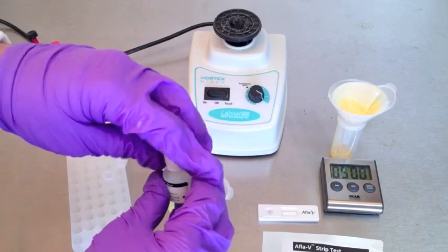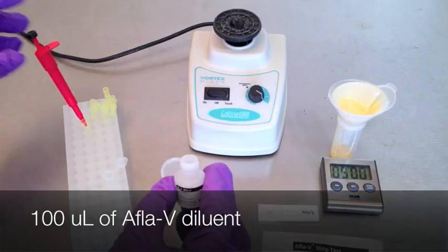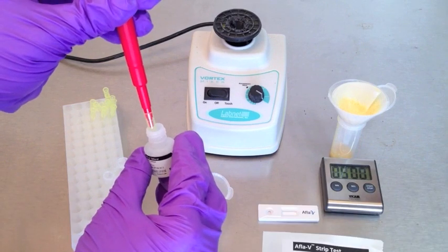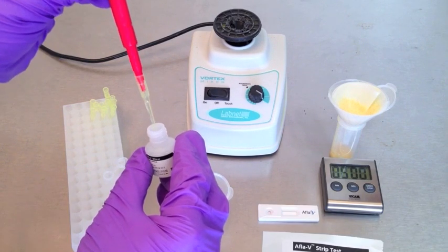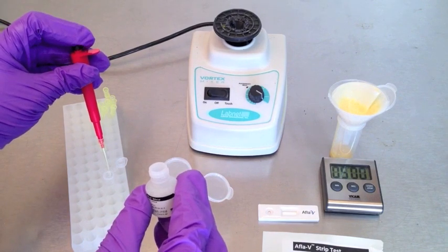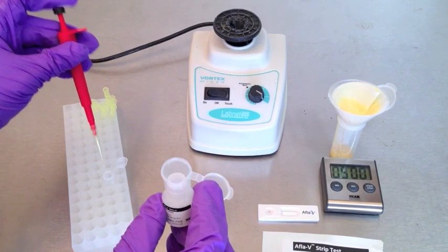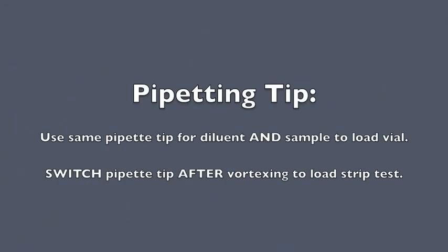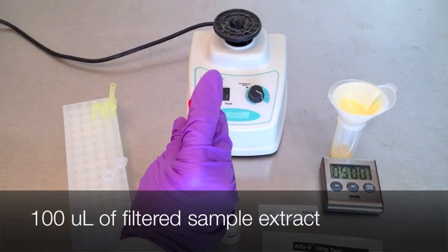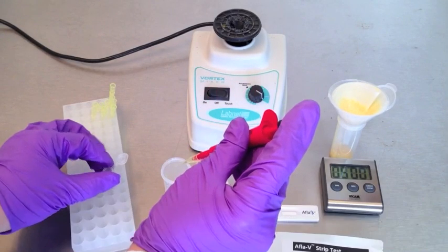Transfer 100 microliters of AFLA-V diluent to the strip test using the pipetter. Press to the first stop and release to pull liquid into the pipetter, then push down to the second stop to release the fluid. For best results, hold the pipetter vertically. Prime the tip of the pipetter by filling and emptying the tip once: press to the first stop and release to fill, then push to the second stop to release.